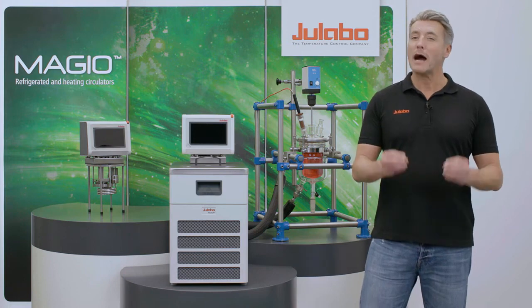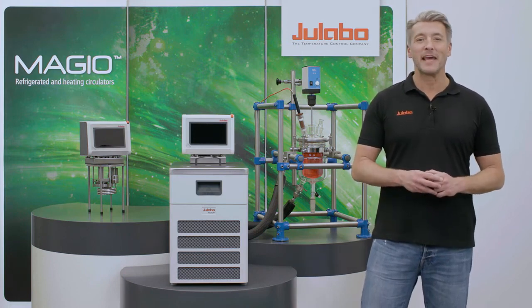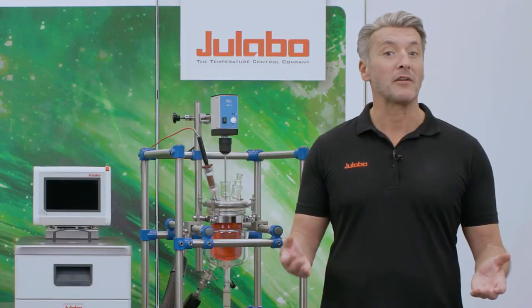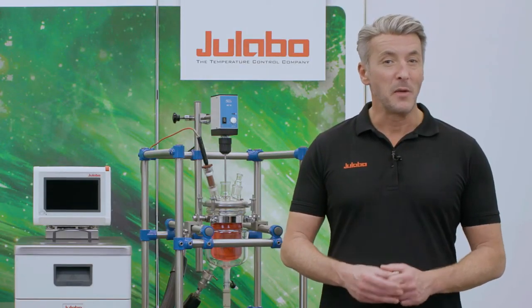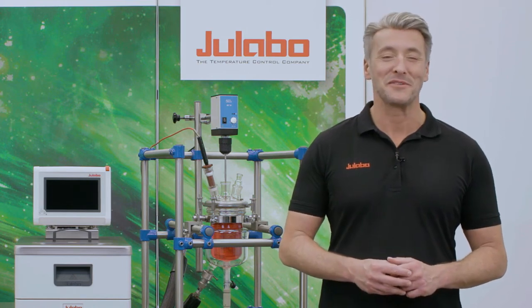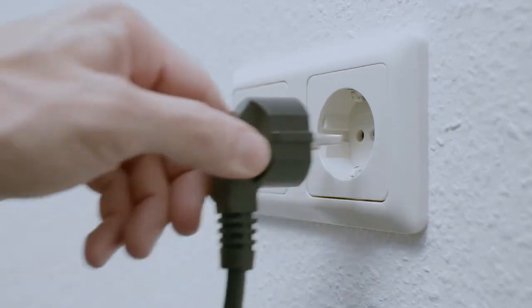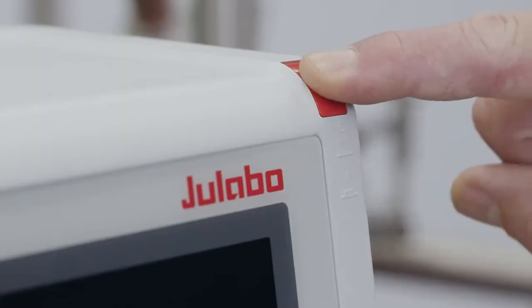Today I will show you how easy it is to fill an external application connected to our Magio circulator. If you haven't seen our video about how to connect an external application, make sure to check it out first before you're proceeding. After you connected the external device, connect the Magio to the mains voltage and turn it on.